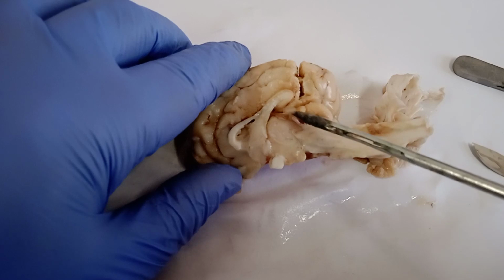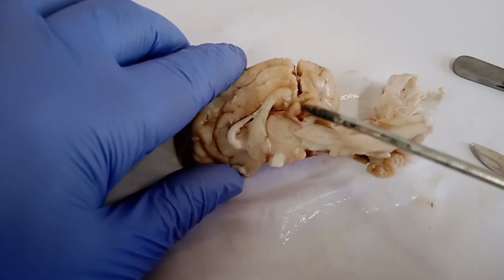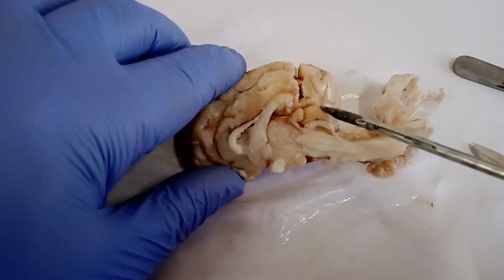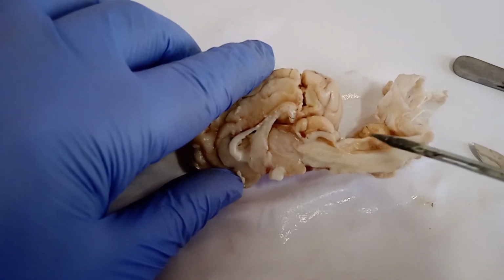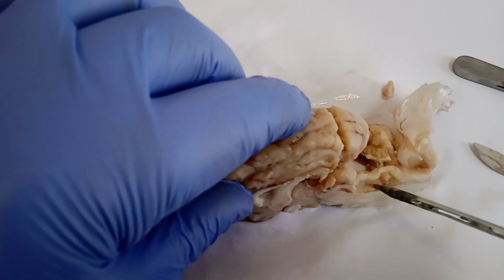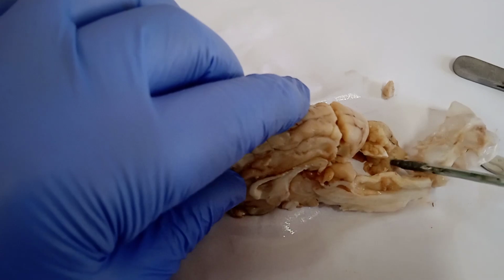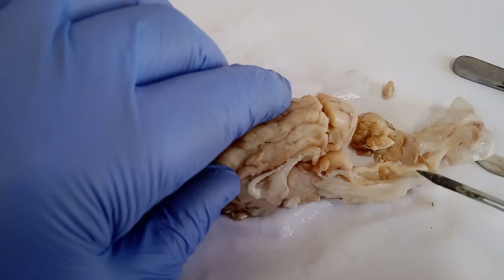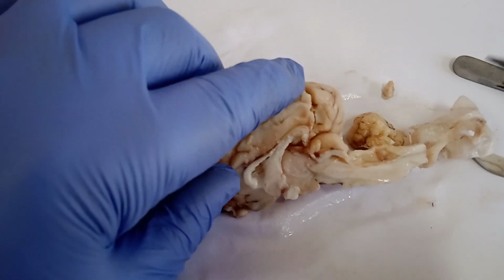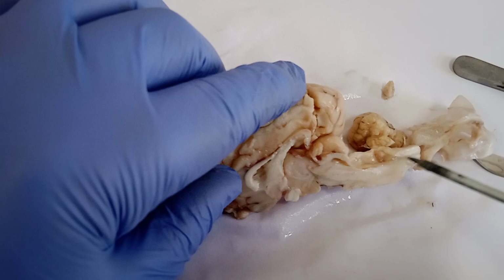This is the pineal gland, it has come whole with this part. This is the part of the corpora quadrigemina and superior colliculi, and this is basically the part of the fourth ventricle, because this cerebellum has come out, so this is the fourth ventricle, and from here the spinal cord will start. This is basically the spinal canal, because this is the spinal cord.